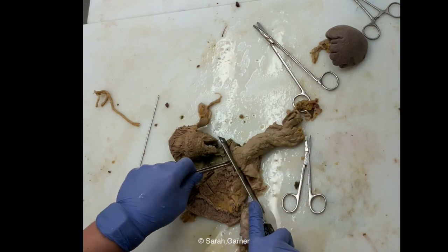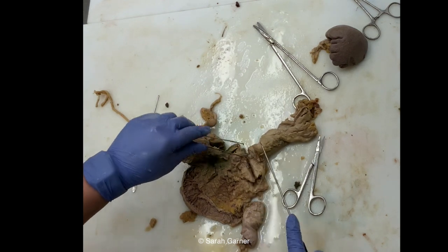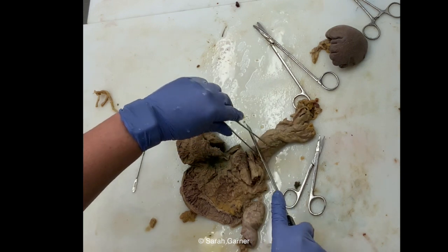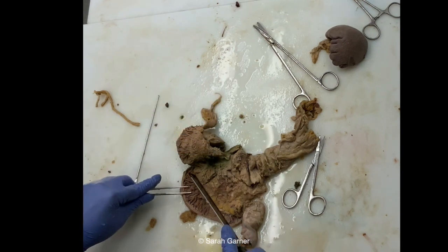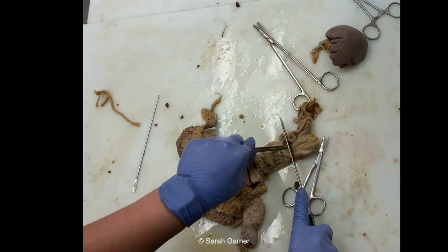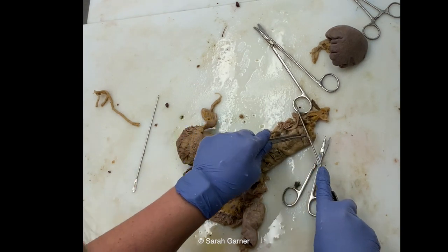Now, if you need to weigh the pancreas, different places will have different rules. I feel like most of the time the pancreas is going to be pretty autolyzed, and so the weight isn't going to be that reflective or helpful. Some places won't weigh it, but if you do need to weigh it, you can trim it off after you get your section and weigh it separately. So it just depends.